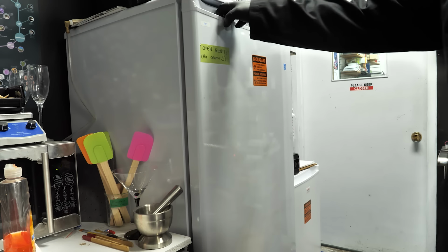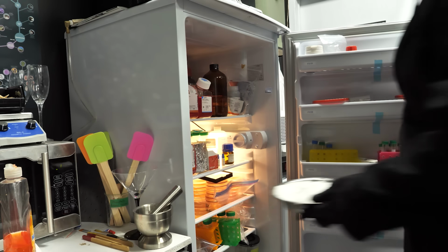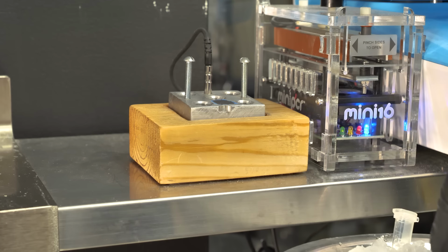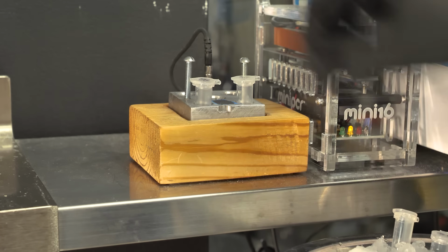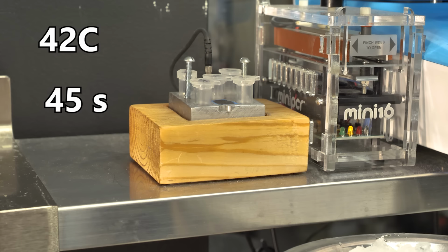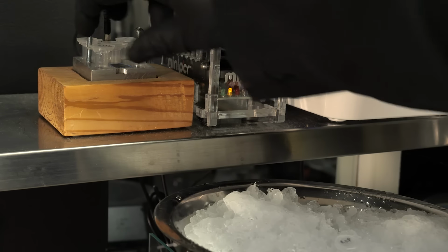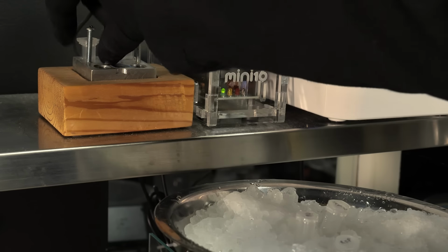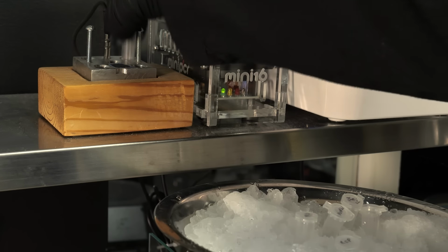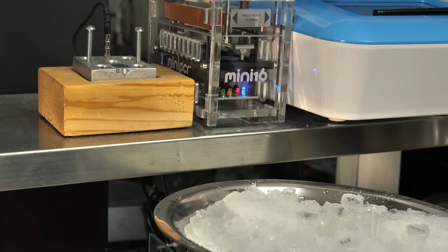Anyway, with our tubes of E. coli inoculated with the DNA, these can be put into the fridge for about 20 minutes to allow the DNA time to get friendly with the E. coli. Then we're going to do what's called heat shocking. Basically, we're going to stick the tubes into a heat block set to 42 degrees and let them cook for exactly 45 seconds. Then we plunge them back into ice. Basically, what we're doing is making the holes in the E. coli bigger and then in one big flush, forcing a bunch of DNA in and slamming the holes shut behind.